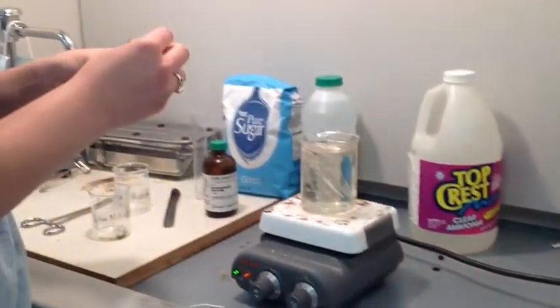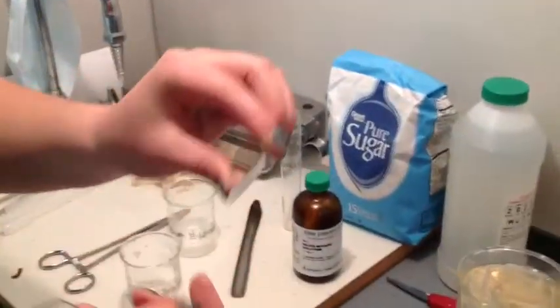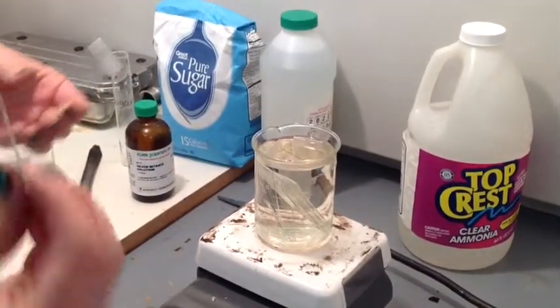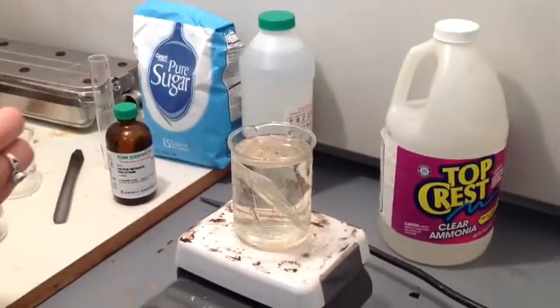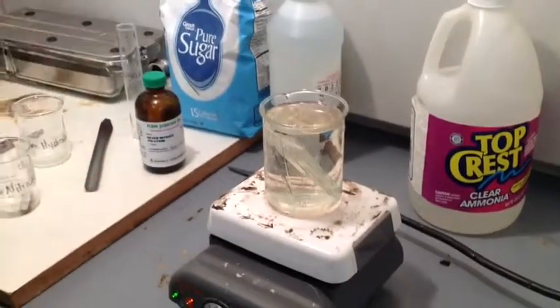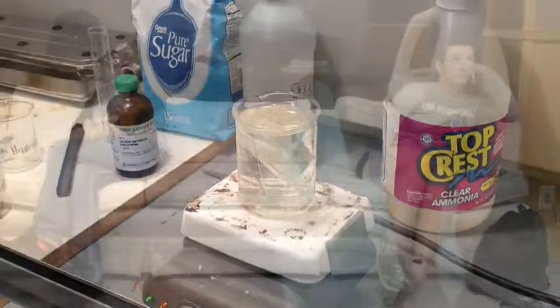Try to space your slides in the beaker evenly, even with the hot plate still on. Don't let them sit in there for more than two hours — a little under two hours, then take out the solution and the slides. What ideas do you have for extensions for your chemistry project? Get a new partner.